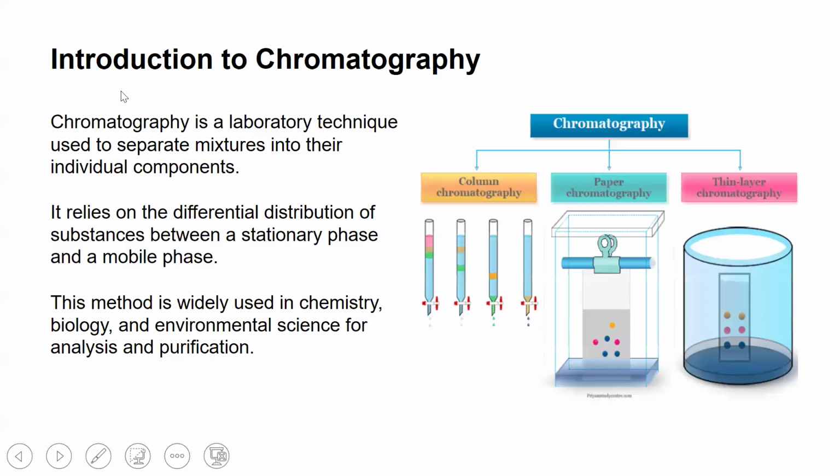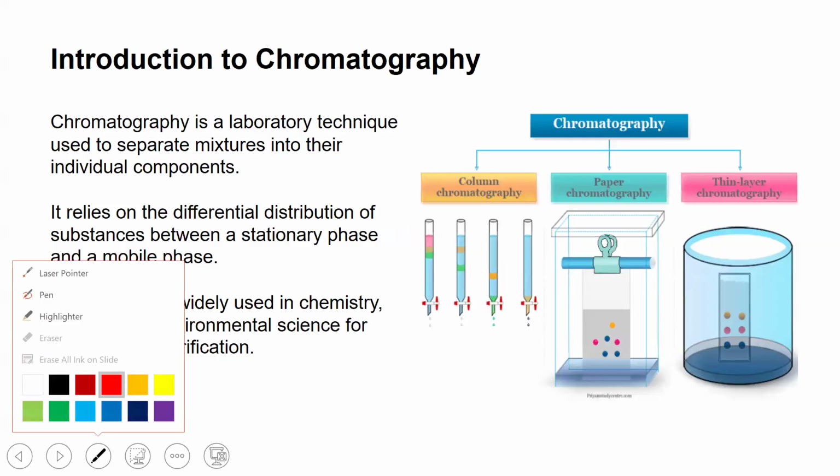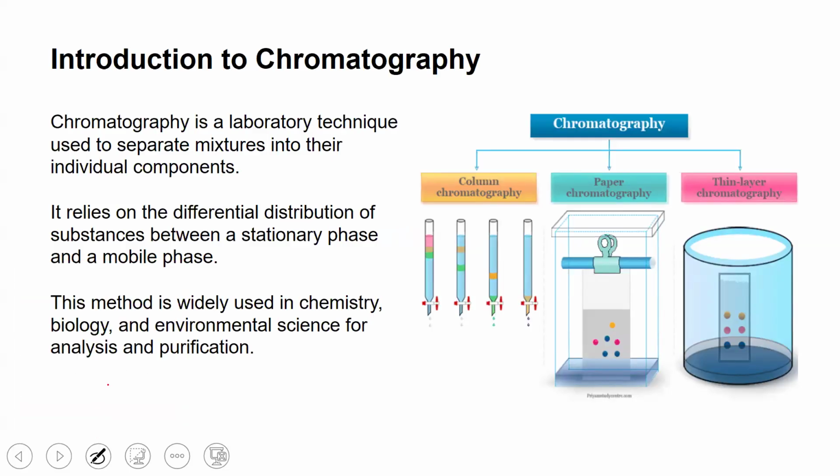So in today's video, we are going to look at the concept of chromatography. Introduction to chromatography. So what is chromatography? Chromatography is a laboratory technique that is used to separate mixtures into their individual components. It is one of the separation techniques and one of the basic laboratory techniques used to separate mixtures into their components.